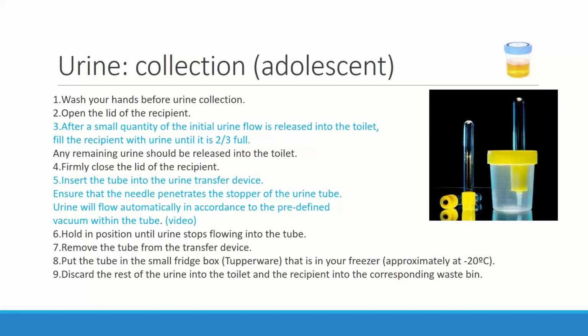You can decide how to explain this to the adolescents, okay? So finally, the adolescents will just freeze the tubes in the freezer at home, okay? And for this, we have given them a Tupperware, a box. So instead of putting the tubes in the freezer directly, we recommend putting them in a Tupperware.